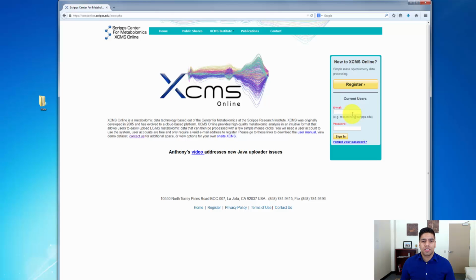In this video I'll be showing you how to upload your data through the HTML5 uploader. Alright, so first I'll want to go to the XCMS Online website and then log in.